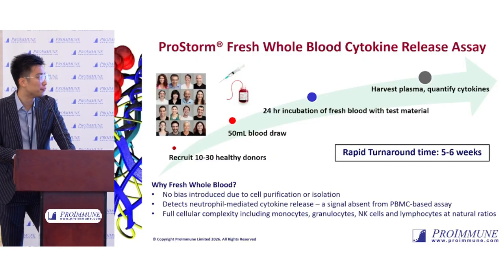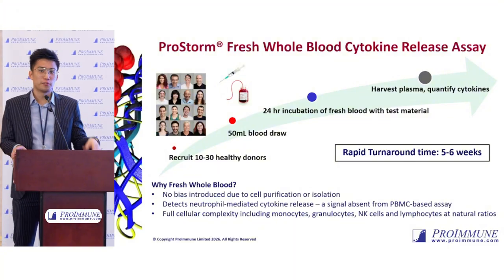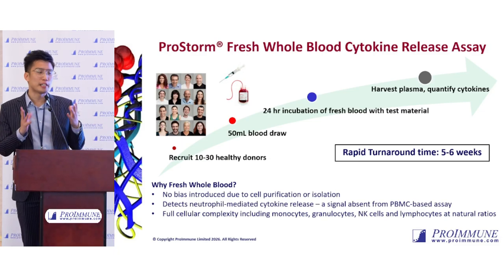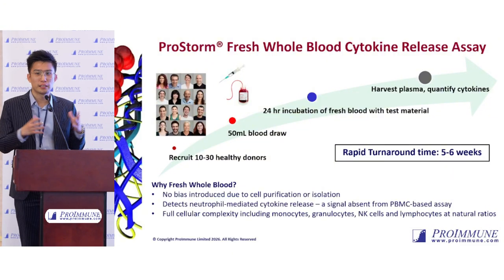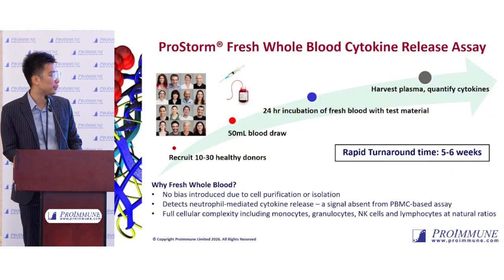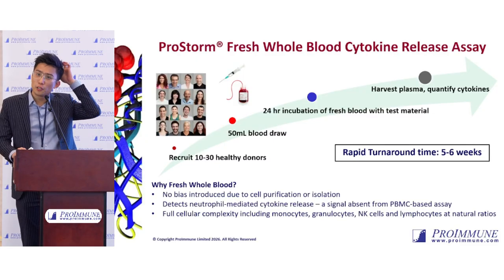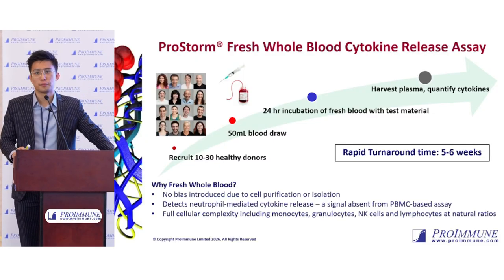There's no manipulation involved. And it also allows you to capture or detect neutrophil-mediated cytokine release, which is a signal that's absent from your PBMC-based assay. And the most important part is that it captures the natural ratios of all your different antigen-presenting cell subsets in the blood itself as compared to your PBMC. In a way, you can think of this as really the closest you can get before your drug actually reaches the clinic. That's in vitro.